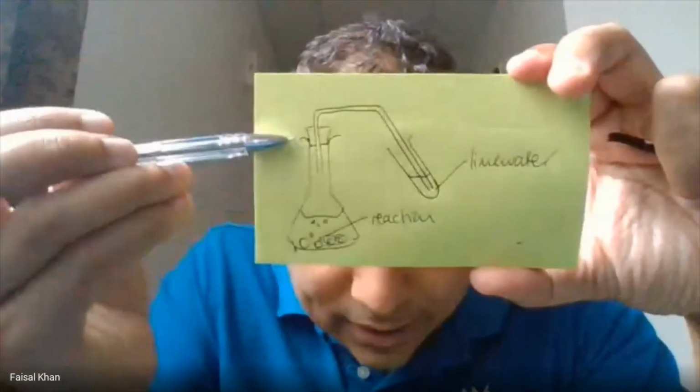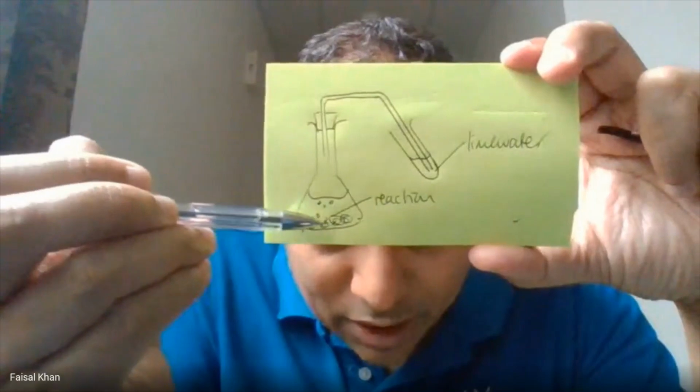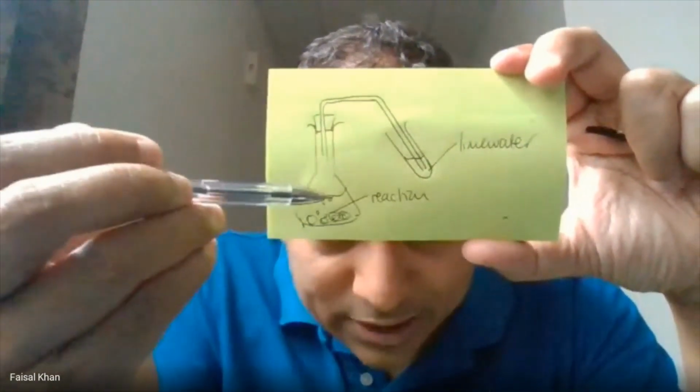And so here's a reaction vessel. This would be with calcium carbonate marble chips. So you would have acid in there as well. This is generating carbon dioxide, okay?